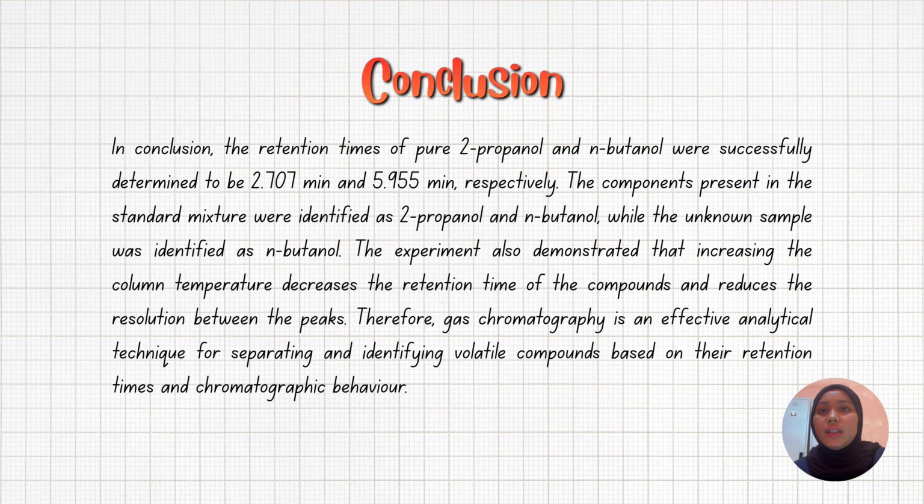In conclusion, the retention time of pure 2-propanol and N-butanol was successfully determined to be 2.707 minutes and 5.955 minutes respectively. The standard mixture was identified as containing 2-propanol and N-butanol, while the unknown sample was identified as N-butanol. The experiment also demonstrated that increasing the column temperature decreased the retention time, but also reduced the resolution between peaks. Therefore, gas chromatography is an effective analytical technique for separating and identifying volatile compounds based on their retention times and chromatographic behavior. Thank you.